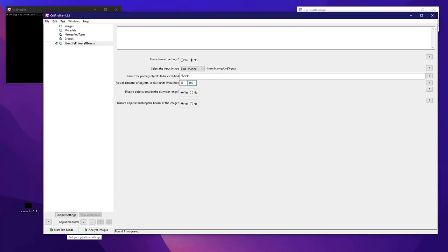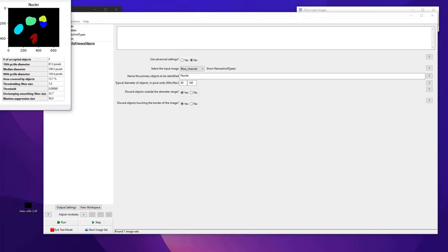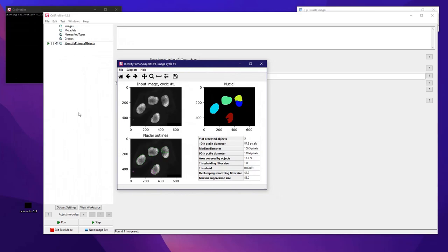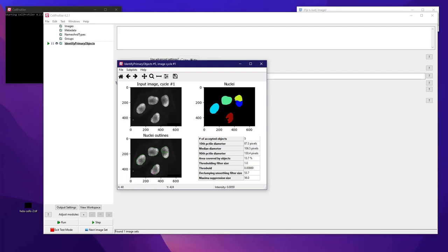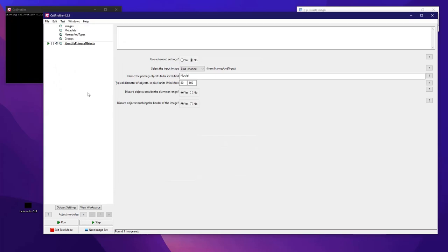To check how it looks, I use Test Mode and press 'Step'. It shows me the original channel, the nuclei, and the outlines of the detected nuclei. There's a slight problem: it has divided one nucleus into separate objects, another is not covered entirely, and there's one small object that was excluded. Outlines in green are objects that are retained, and outlines in purple are objects that have been rejected according to the settings.